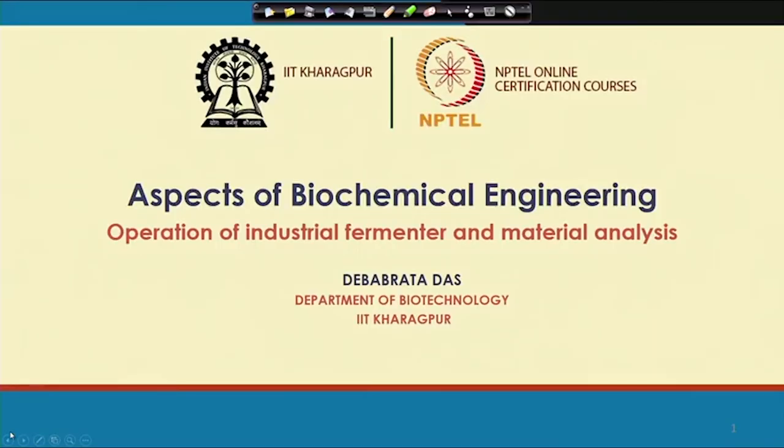Welcome back to my course Aspects of Biochemical Engineering. Up till now, I was discussing different aspects of biochemical engineering, and today I am going to discuss a very new topic, that is the operation of industrial fermenter and the material analysis. Because whatever we have covered up till now, try to understand how we can analyze the process.